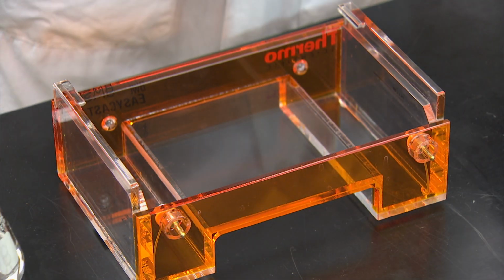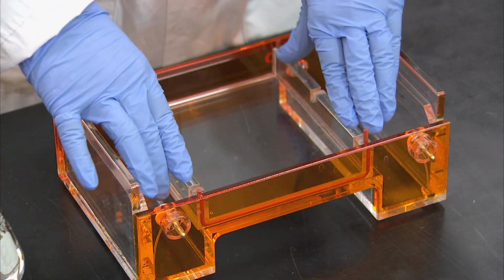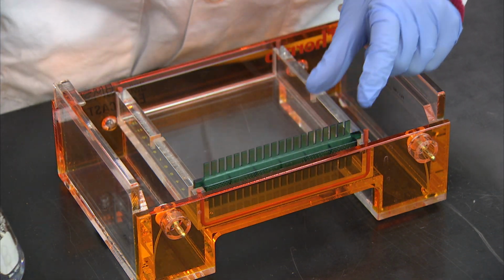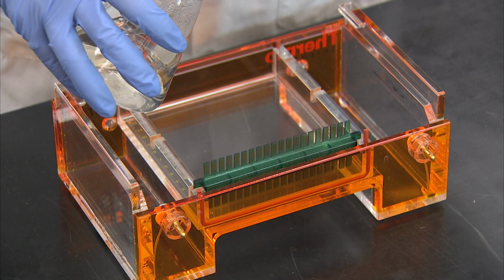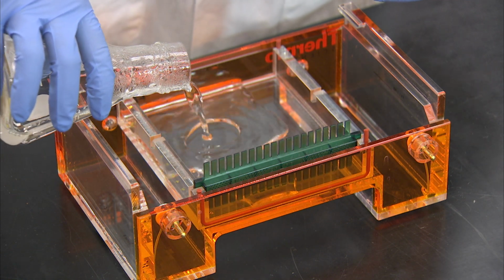The electrophoresis unit shown here is also used for casting the gel by rotating the gel tray 90 degrees. This will place the open ends of the tray against the sides of the electrophoresis chamber, making a sealed casting tray. The agarose is carefully poured into the tray, and it is checked to make sure it is going to set on a level surface and without any bubbles that could affect sample migration.